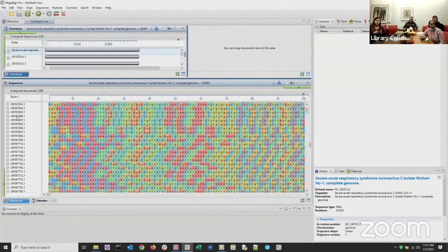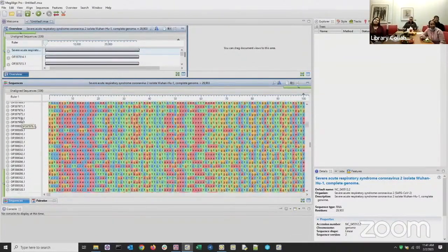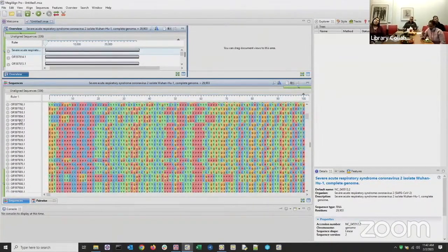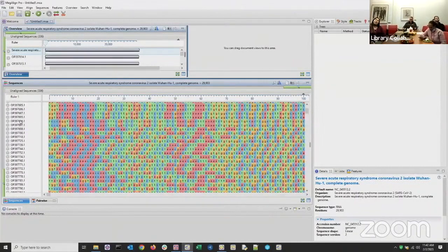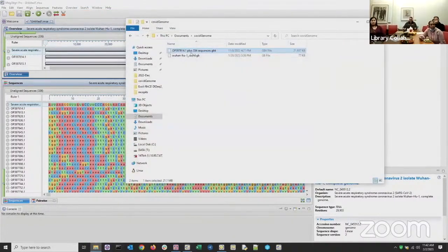Now, all these other strains here, these were all downloaded from NCBI, and they represent 334 of the over 1 million deposits that were made over the last few years to the GenBank depository in NCBI. And we used our tool, I'm not going to show you how to use this, but we used our tool to download these sequences in GBK format.